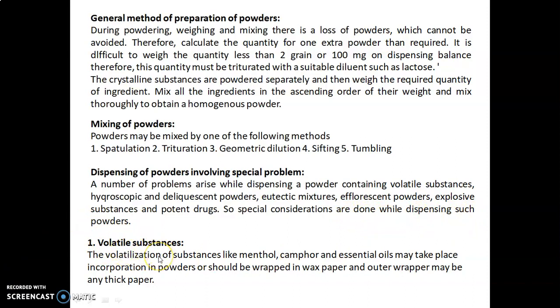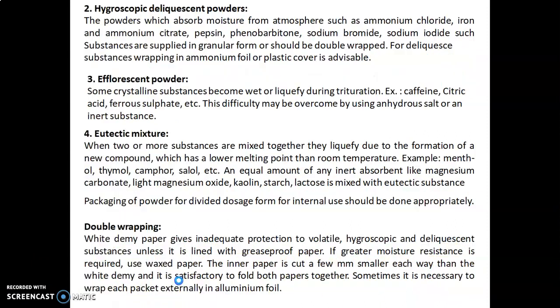Volatile substances. The first problem is for the volatile substances. The volatilization of substances like menthol, camphor and the essential oils may take place. Incorporation in the powders, or they should be wrapped in wax paper, and the outer wrapper may be any thick paper.